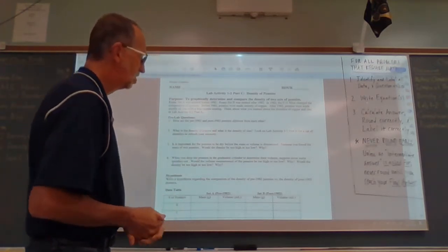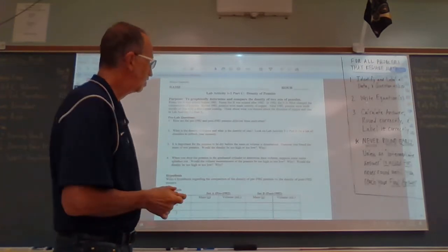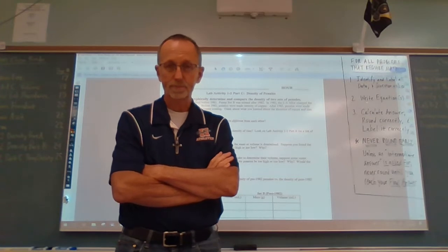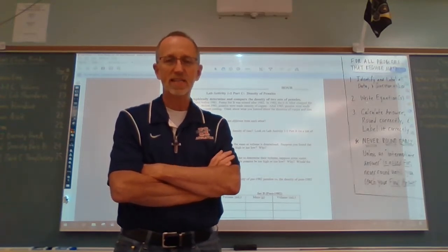All right, in 1982, the U.S. Mint changed the composition of pennies. Before 82, they were made entirely of copper, all right? So, pure copper, 82 and older, all right? In 82, why do you think they changed it?